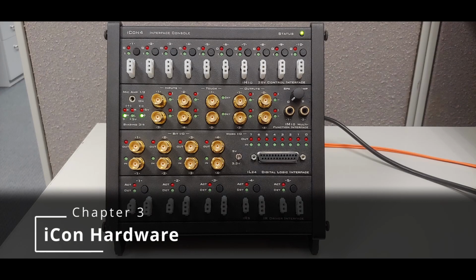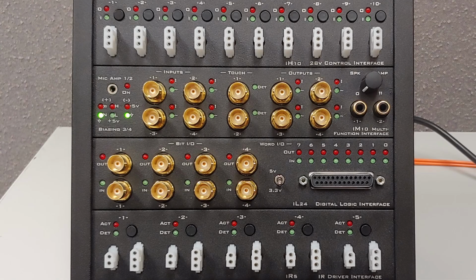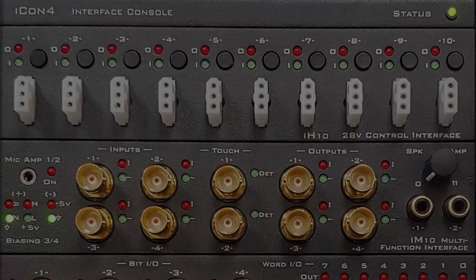The iCon is an interface to external behavioral hardware that the subject will interact with. It runs on wall power and has a fiber optic connection back to the RZ processor for communication. It has interchangeable digital and analog modules designed to interface with the different connectors and power requirements of your external hardware. The two most common modules are the IH10 and the IM10.